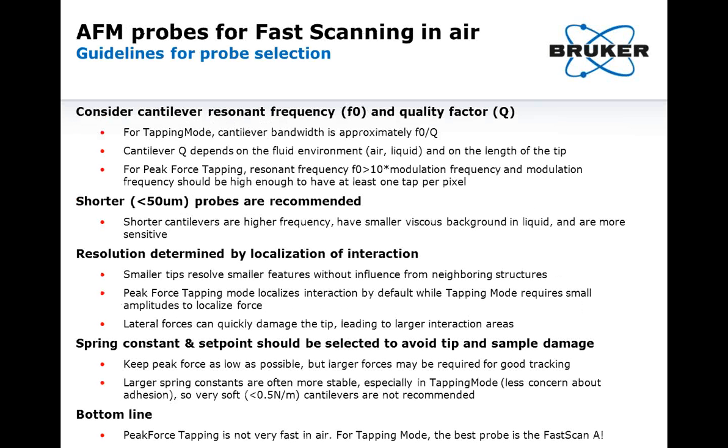So, a quick guideline for selecting AFM probes for fast scanning. We need to consider the resonant frequency and the quality factor. For tapping mode, the cantilever bandwidth is approximately the fundamental frequency divided by Q. Q depends on the fluid environment, air, water, etc., and the length of the probe.